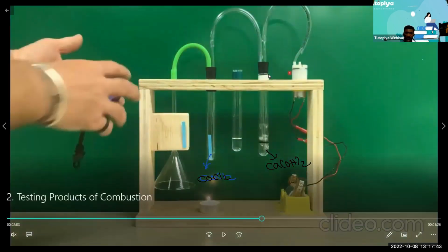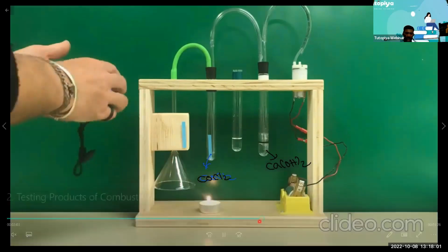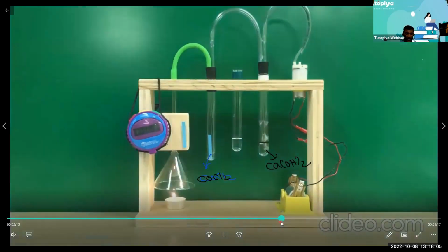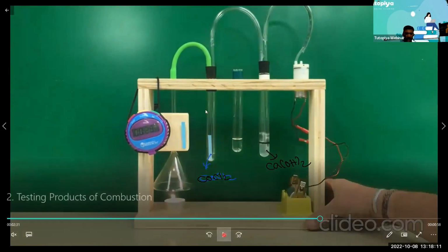And I connect a vacuum pump here, because this vacuum pump sucks the air from the right tube, and that will suck all the air from the first tube, and that will suck the gas. A suction pressure is created, so you have a current of air passing through the entire setup. I'll also connect a timer to see how much time it takes to observe the change in color of the cobalt chloride and of the calcium hydroxide. So this is actually what's happening.